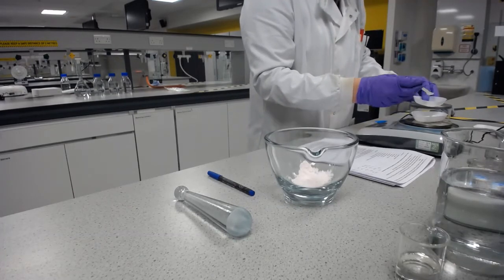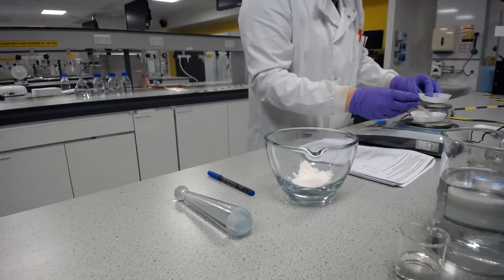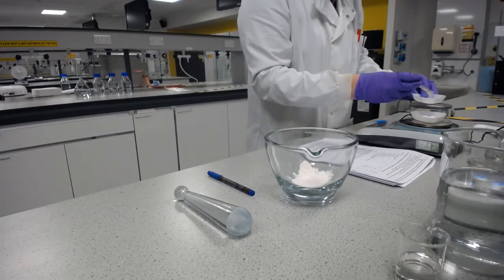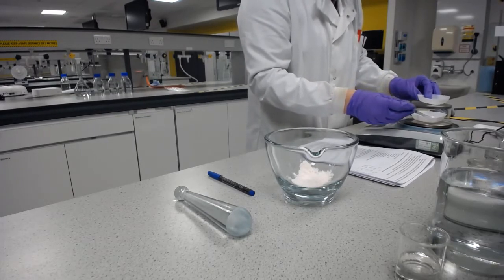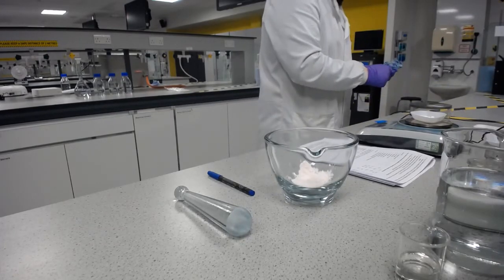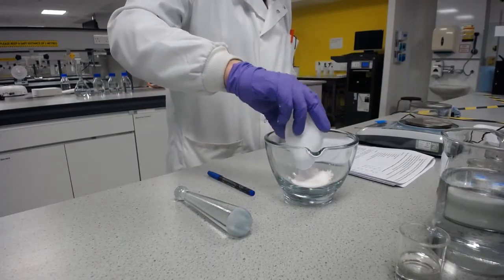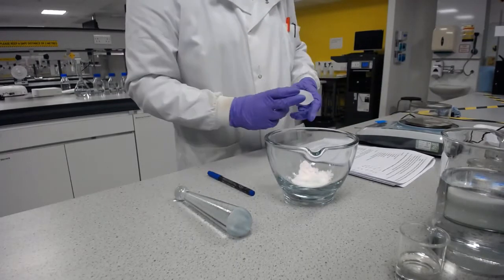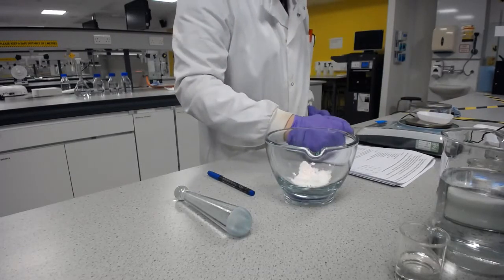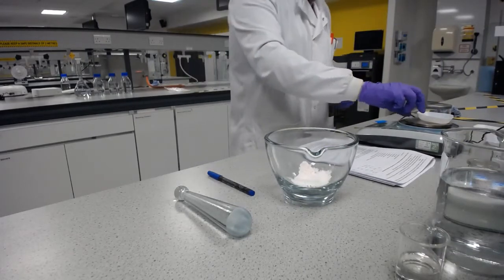They're all going in the same one. Okay, now those two are in all of them because they're active ingredients. And then in this one, which is formulation C with everything in, 1.5 grams of bentonite.